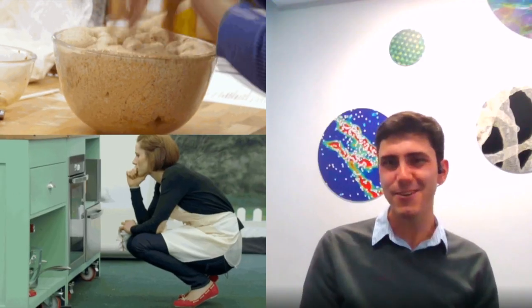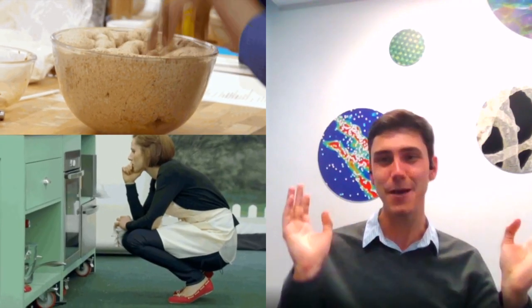So I did all sorts of really cool experiments. The one that springs to mind is we make these metal oxides sort of like making a cake. We mix all of the reagents together, push it into a pan, and heat it up in an oven, except it's like 800, 900 degrees rather than 220 for 30 minutes. And the literature, when we started the project, said you needed about 8 hours to complete the work. But in some experiments we had done, we found it was taking more like a couple of minutes. But we wanted to know just how fast.